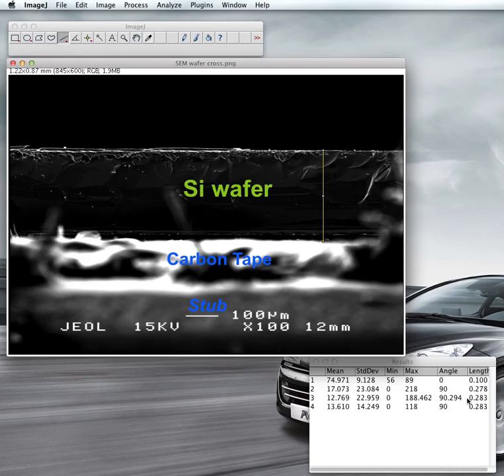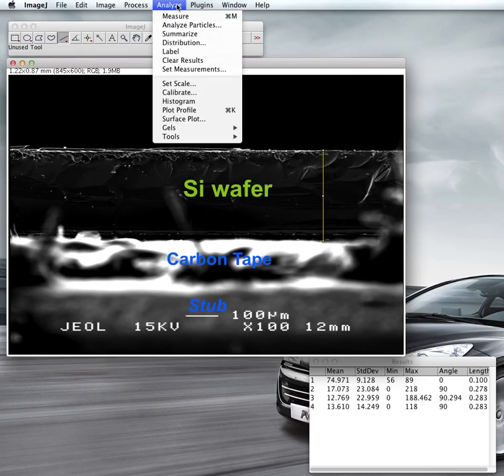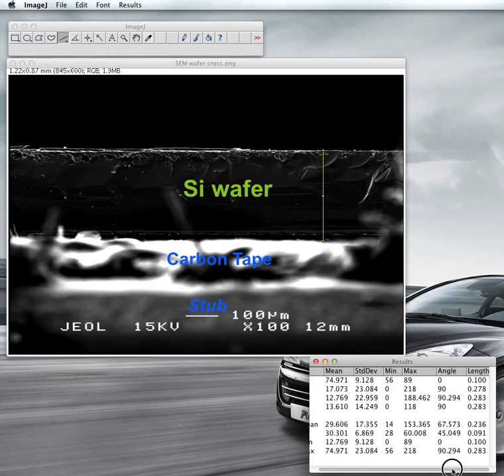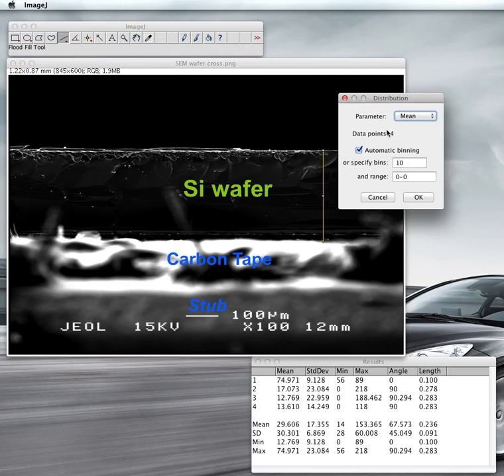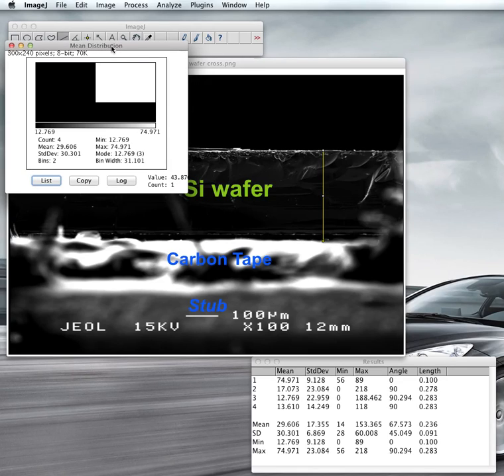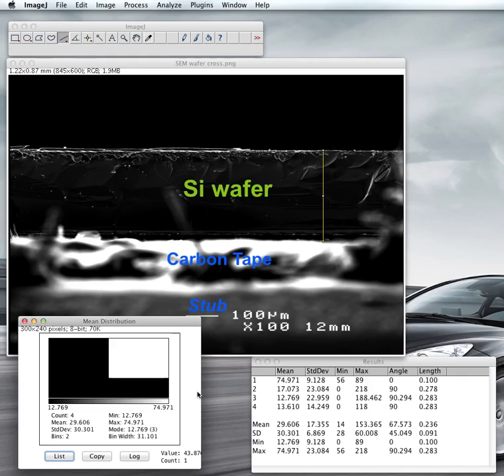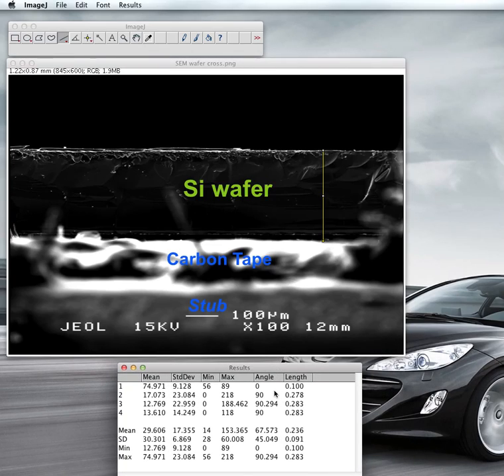Once you are satisfied with your measurements, go to Analyze and then Summarize, or perhaps Distribution. You'll get a summary showing the mean value, minimum value, maximum value, standard deviation, and the mean of the overall data. You may also get distribution information. If you only have four data points, the distribution may not be very meaningful, but the simple results help you measure the total length within this SEM micrograph.